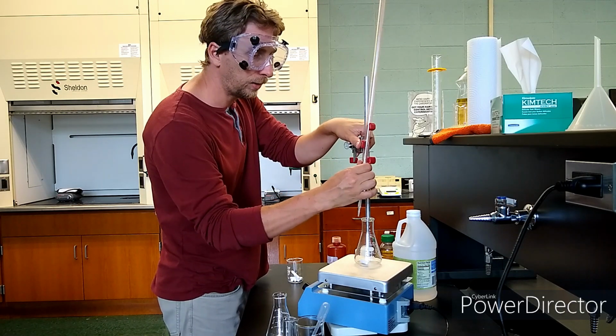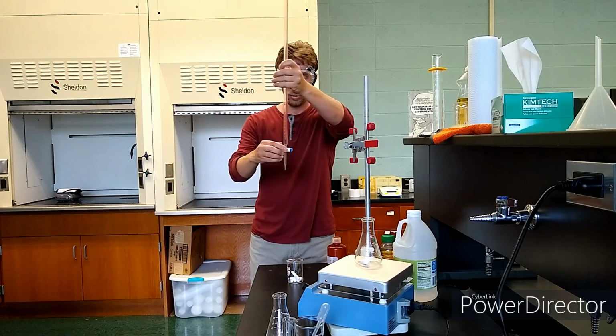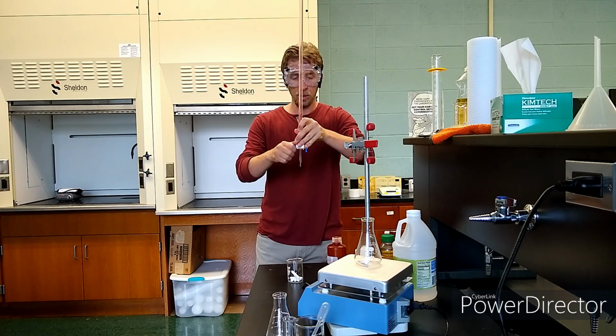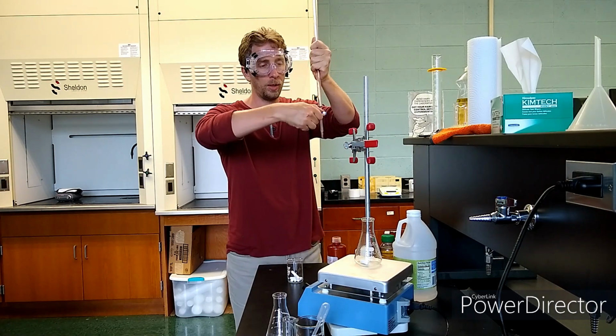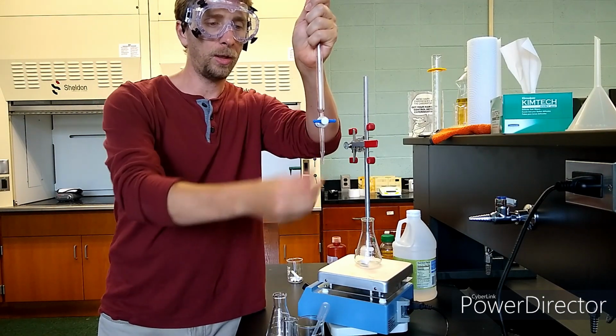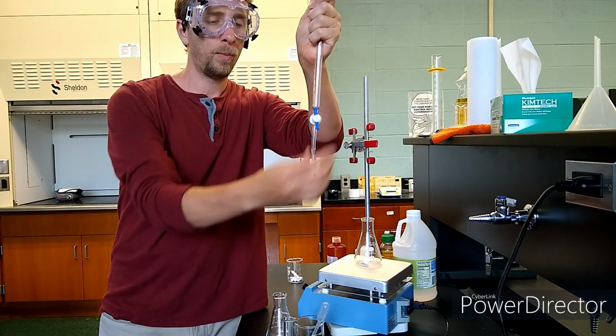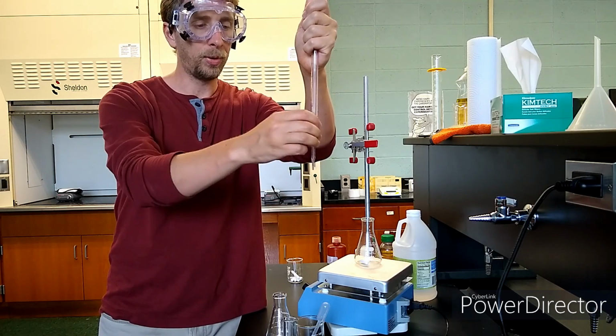Okay, so the first thing you've got to do to set up your titration, or before you do the titration, is make sure your burette is in working order. This is the stopper, and when you turn it perpendicular with the rest of the burette, that's when it's closed, and when you open it up parallel with the rest of the burette, that's when it's open, and it will drain out the tip.